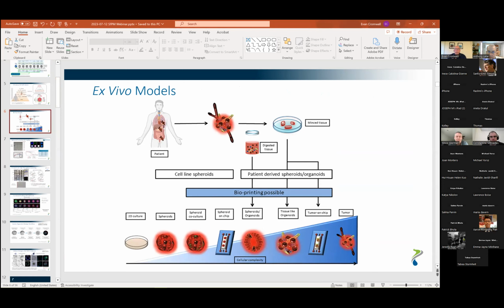So the short answer is it depends on the sample. Some patient biopsies, you can take them, put them into fragments, and within probably 3 to 5 days, you can have a viable sample to run. Others might take longer time periods to really form a good number of 3D cell models where you could have enough samples to run an assay.